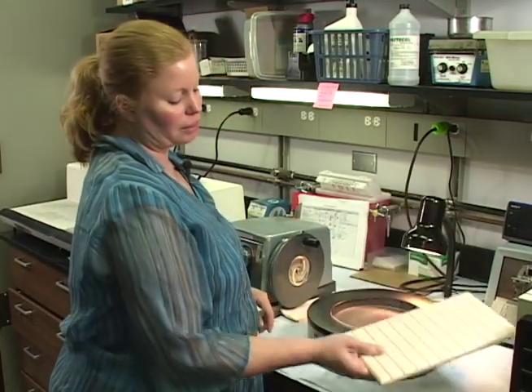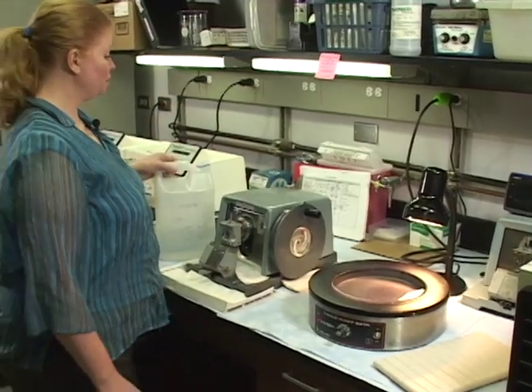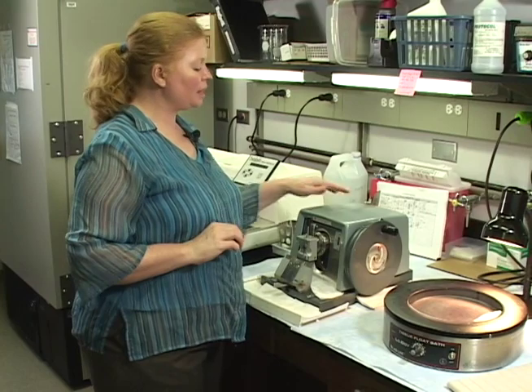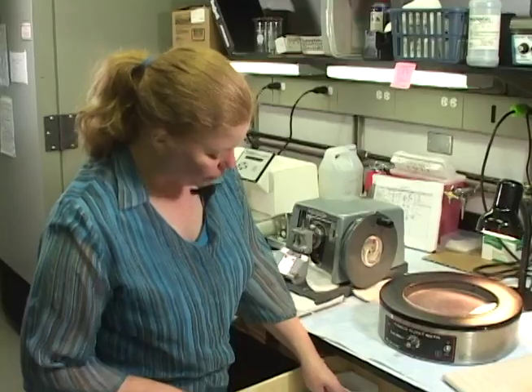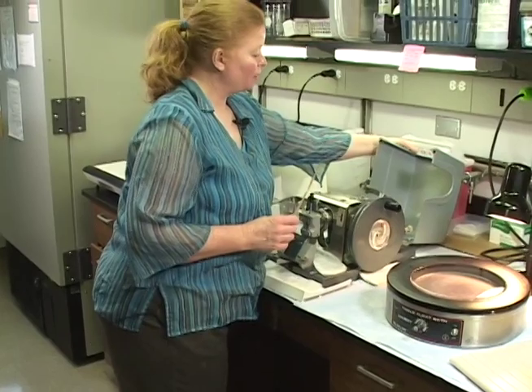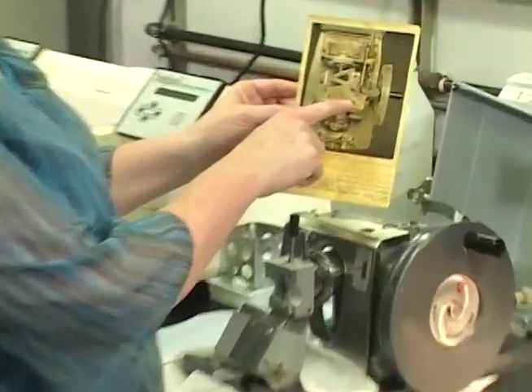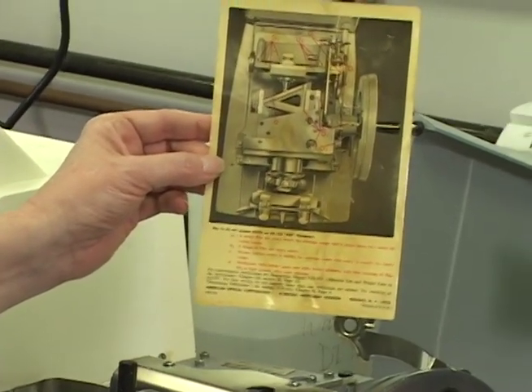This is a slide holder that I gather the slides on as we're going. This is our AO microtome. It's an oldie but goodie. This AO microtome has a few little quirks, in that every time you use this microtome, you need to oil it. I have this that actually came with the microtome. You open it up. This was actually in the top of the microtome at one point, and I've taken it out. This shows you where to oil this microtome, and has it very clearly marked.